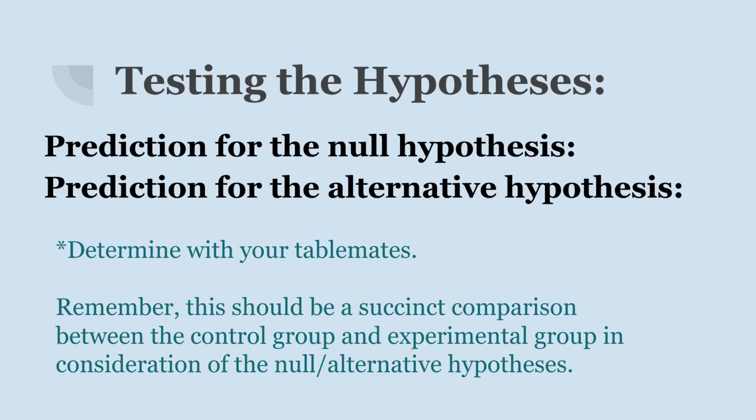And then for the alternative hypothesis, you could state that banding was not present at 250 base pairs in the experimental group, but in the control group, banding was present at 250 and 300 base pairs. And again, you'd want to clean that up.